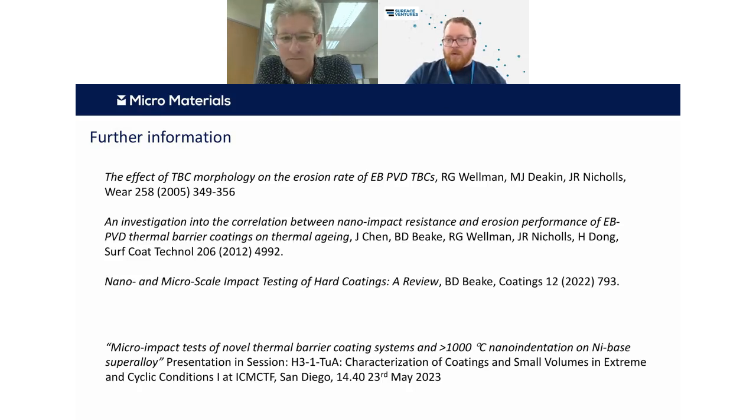Okay, a question from Doris here. Once again, who has said, I'm new to the field. Is the instrument itself a specific instrument for impact testing, or is it a nano-indenter used in a harsh mode? I think essentially it is a nano-indenter used in a harsh mode. The Nanotest Vantage system is essentially a multifunctional nano-indenter system for nano-indentation, also various tribological tests such as scratch testing, reciprocating wear testing, fretting testing, and also impact testing. What we've done here is take our impact module and expand its test capability, and use that module to run all of these tests. These are multifunctional systems, and customers configure their systems with whichever modules they need.